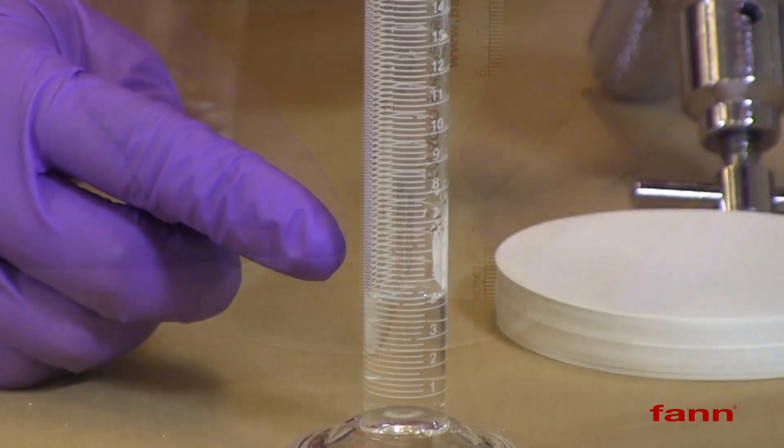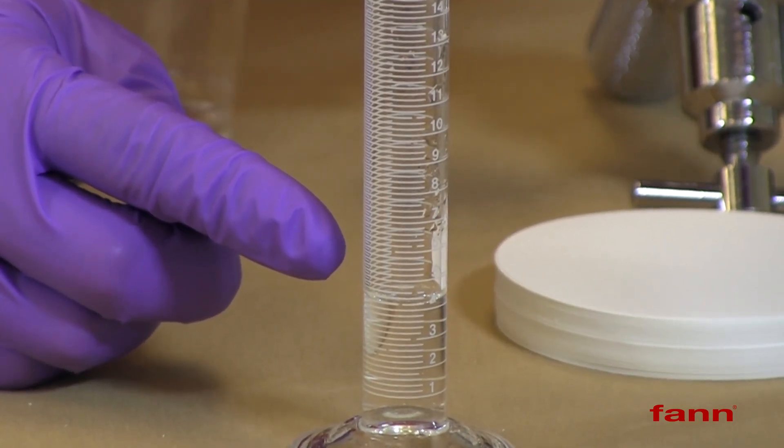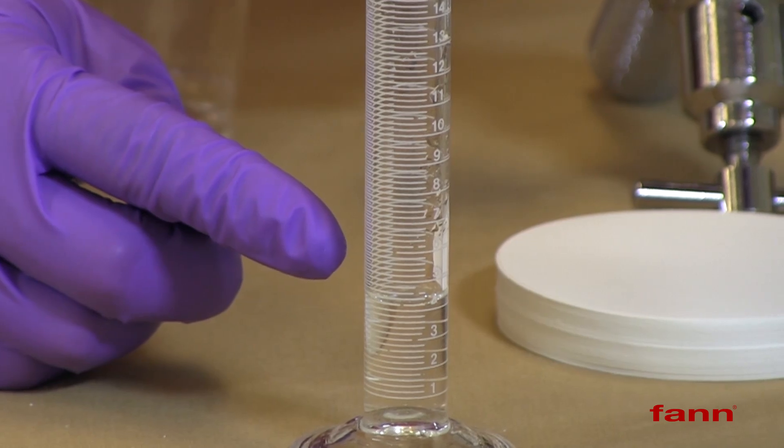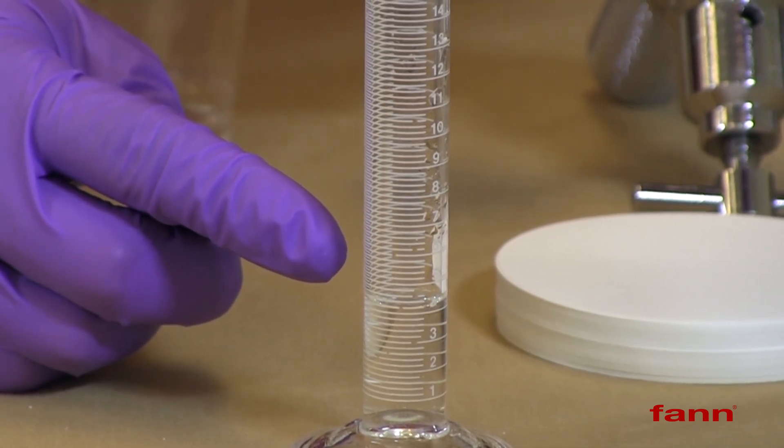Read the filtrate volume in the graduated cylinder to the nearest one-tenth of a milliliter. The filtrate volume here is 4.2 milliliters for 30 minutes.